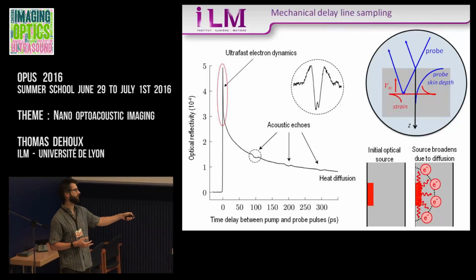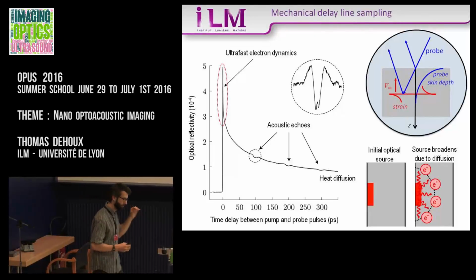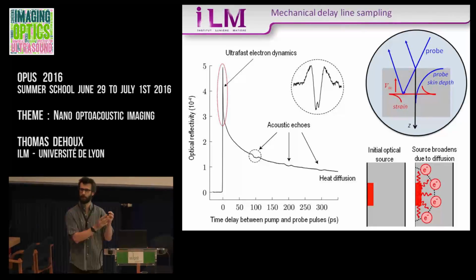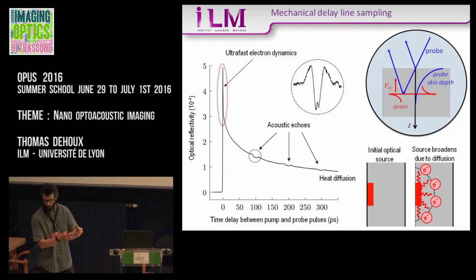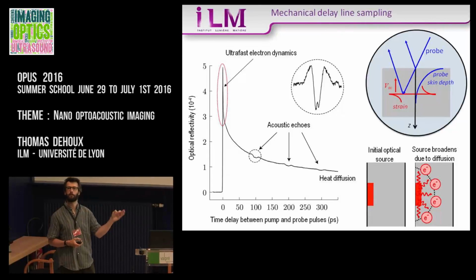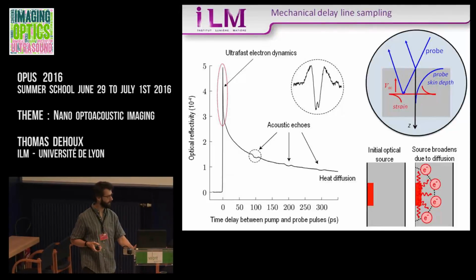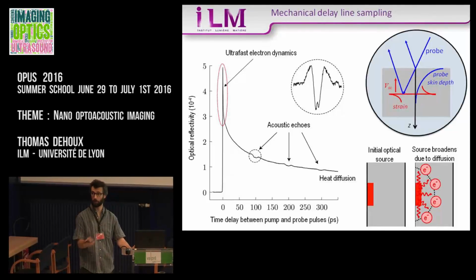So if you place a liquid or cell on this surface and you have electrons, you have a risk of doing a sort of hydrolysis of the cell and generating hydrogen, which the cell would interpret as a trigger to commit suicide, which is called, in a more fancy way, apoptosis. It's a programmed death process inside the cell, which will be triggered by these negative carriers. So you want eventually to avoid this.